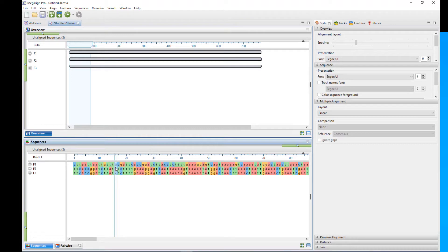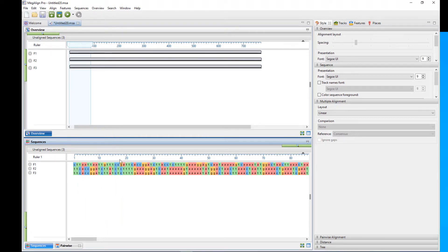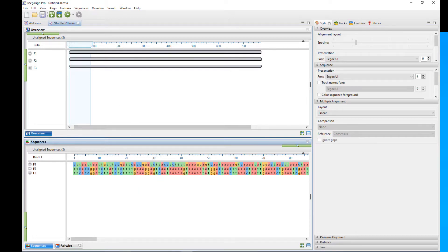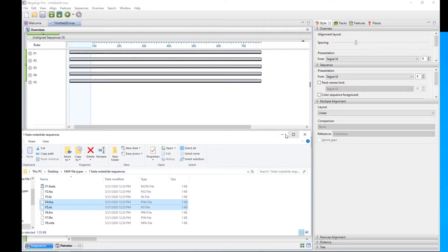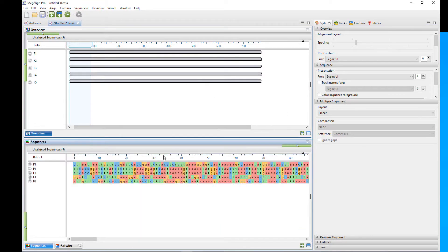So similarly, I drag and drop those samples from the welcome screen. They can also be brought in when you're within a project such as right now. I'm just going to grab some additional samples. You can drop them anywhere on these windows and they will be brought in.